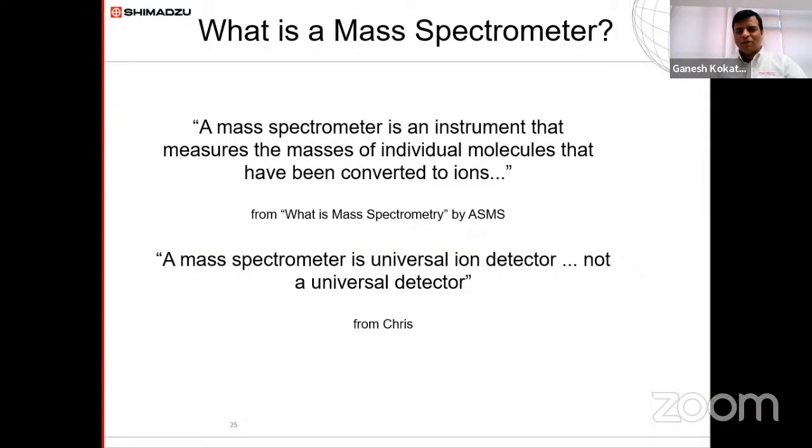I'm not going into detail about the definitions and all those parameters, because you are all currently doing all the definitions, and I have a lot of exams over there. So I'm not focusing on the definitions. I will give you the practical demonstration, how it works, and what the different phenomena of the MS are.